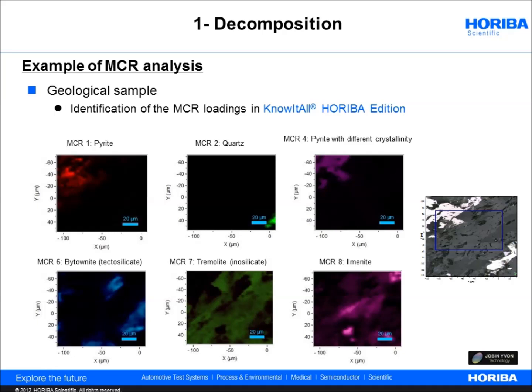Finally, be aware that not all the loadings might be interpreted, especially if the dataset contains artifacts due to high background fluorescence, etc. It is thus important to apply the necessary preprocessing prior to analysis to remove undesired variability.